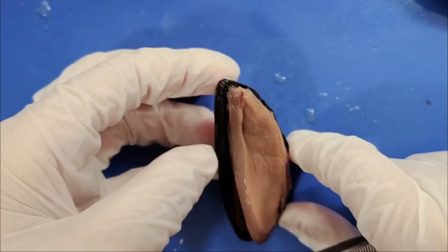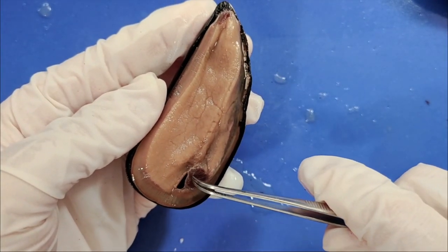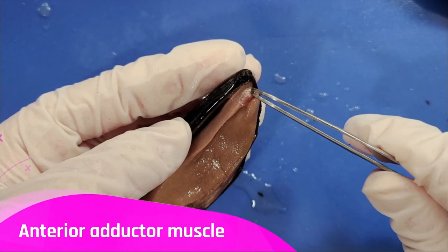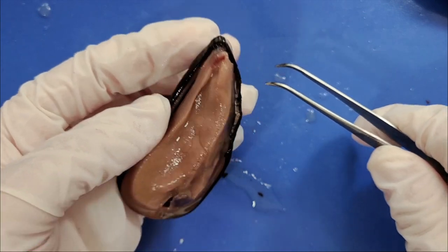Now let's look at the adductor muscles. Here is the posterior adductor muscle, which is a lot bigger than the anterior adductor muscle, which is here and is a lot smaller.